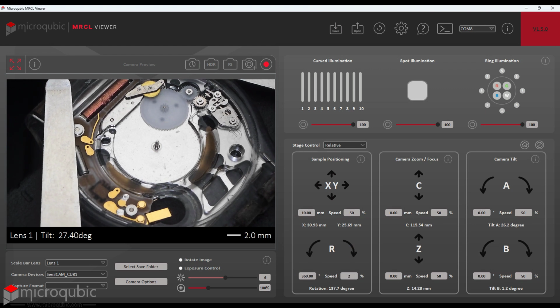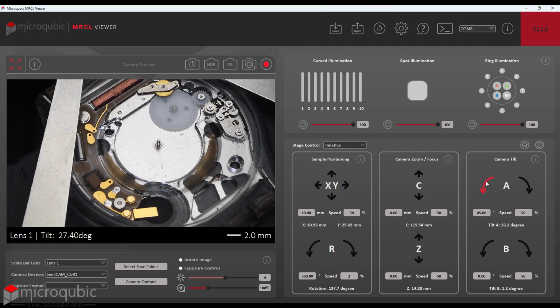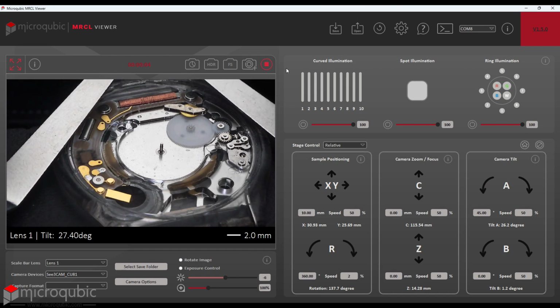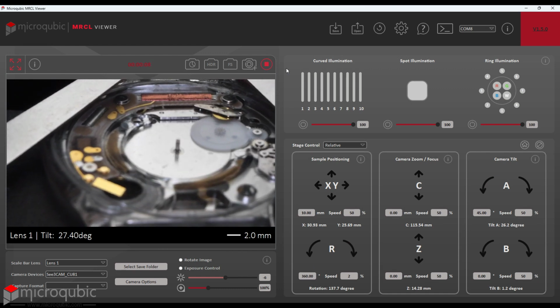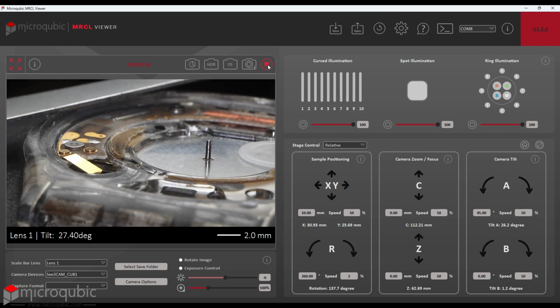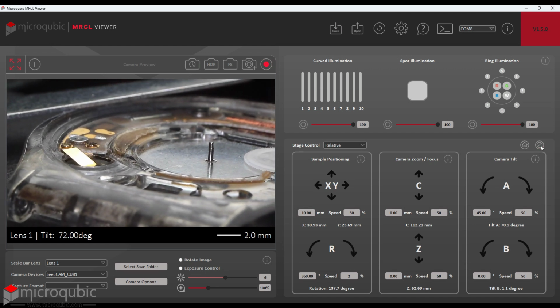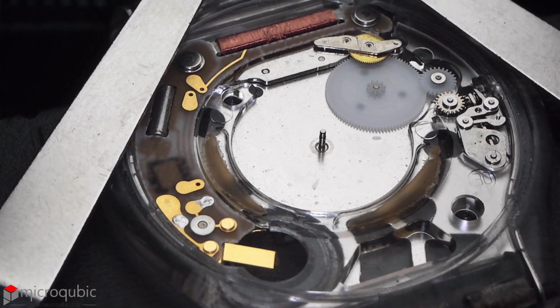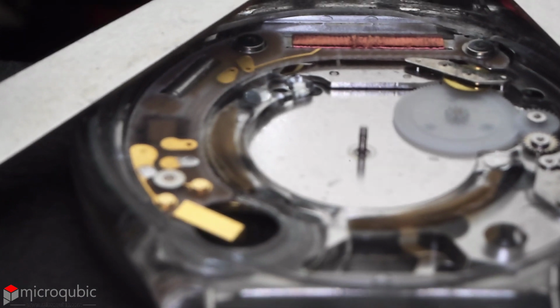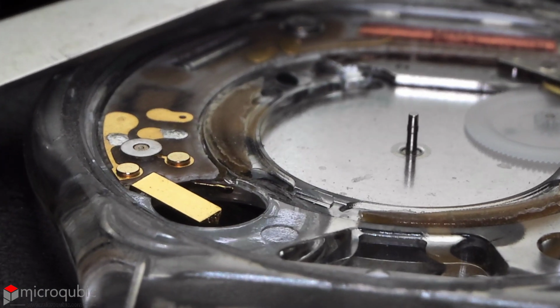In the relative mode, start the sample rotation and tilting at a very low speed and start the video recording. At the same time, you can use the joystick or other buttons to control the zoom level or XY positioning. We recommend doing this at a low speed to better control the focus and position. Then stop the recording. For the actuators, you can wait until the program movement is finished or press the emergency stop button at any time.